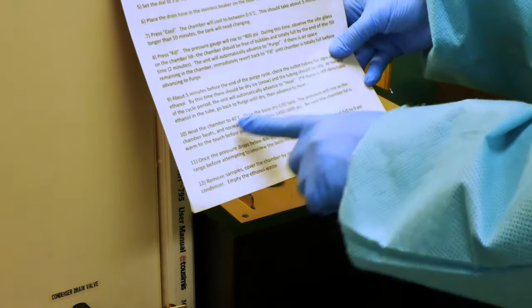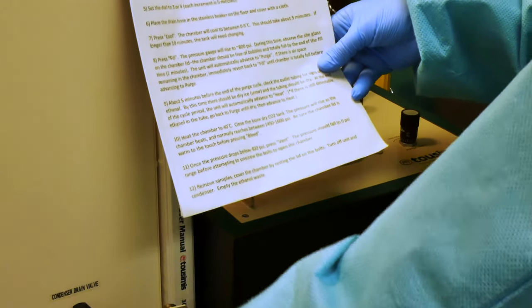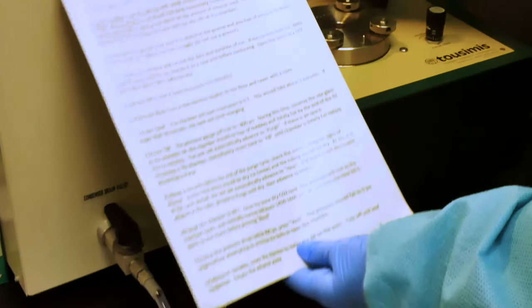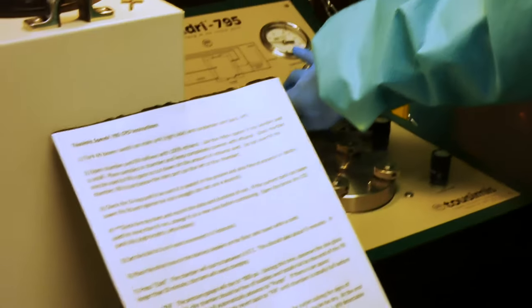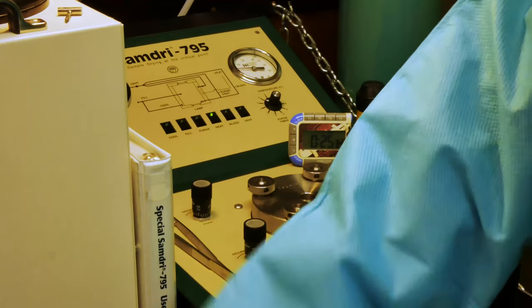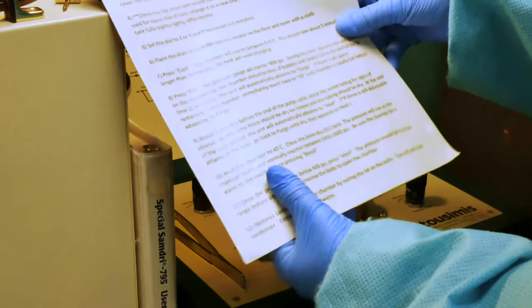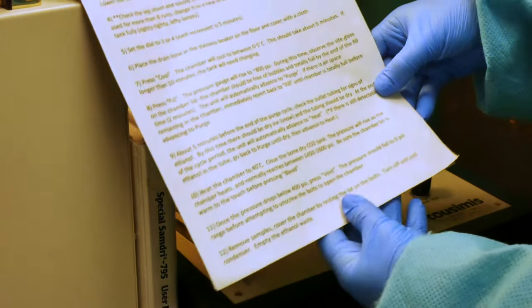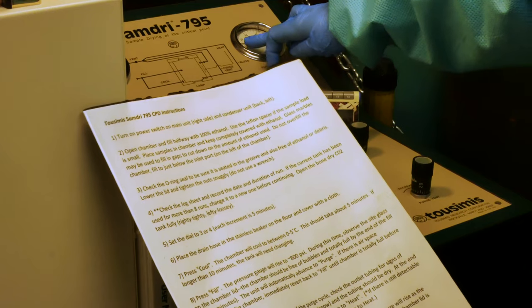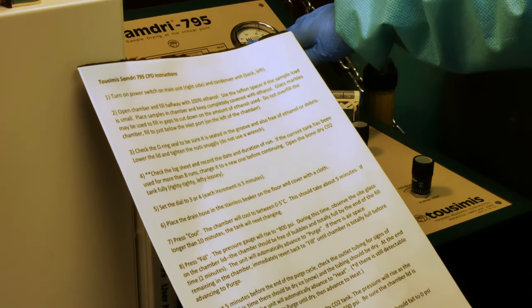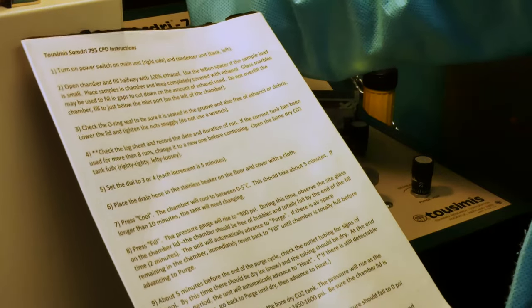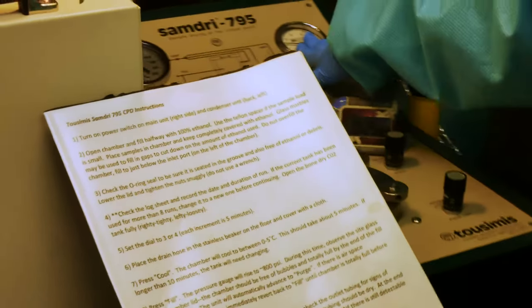So when it came to the end of the purge cycle, we continued to see the frosting get thicker and thicker. And so it did advance by itself from purge to heat. The exchange is good when it's that frosty. At this point, now that it's advanced to heat, the chamber has started to increase in temperature. It's up to about 12 degrees right now. We're still at about 800 psi, but we will expect both of these gauges to go up.